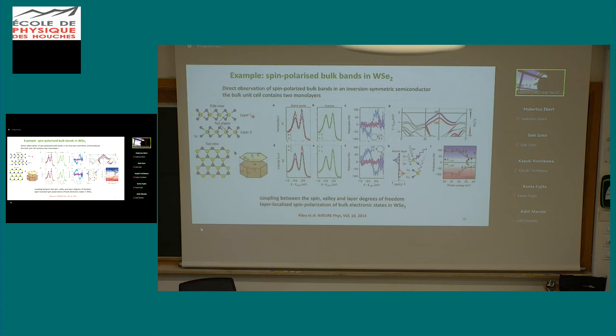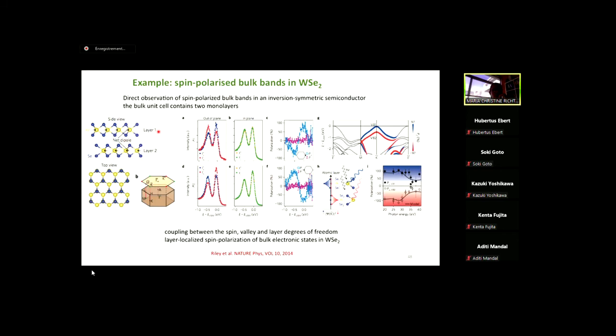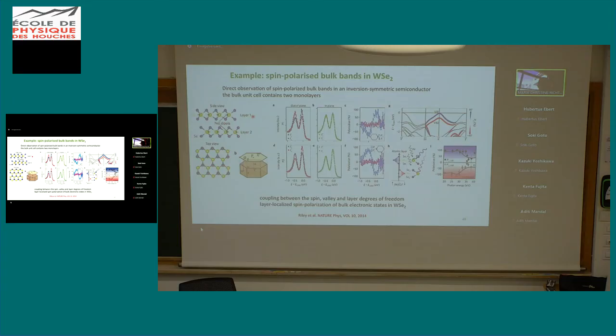And with the discovery of graphene, people were really interested in these layered materials, because graphene, as you know, is not a semiconductor. So for building components, they would search for two-dimensional materials which would be semiconducting, and people discovered a huge amount of TMDC materials. And being layered means that you can exfoliate single trilayers and then work with that. So here this is a study of spin polarized ARPES, spin sensitive or spin resolved ARPES.